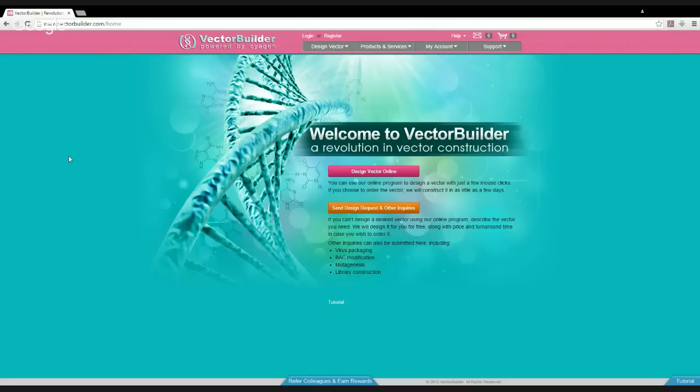You can also click on this and request modification of an existing backbone, should you have a particular vector in-house that you'd like to modify. For today's webinar, we're going to be covering the design of a basic lentiviral vector. And so to get started, what we'll do is click this Design Vector Online button.